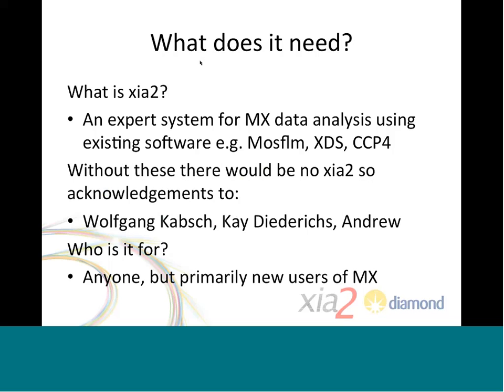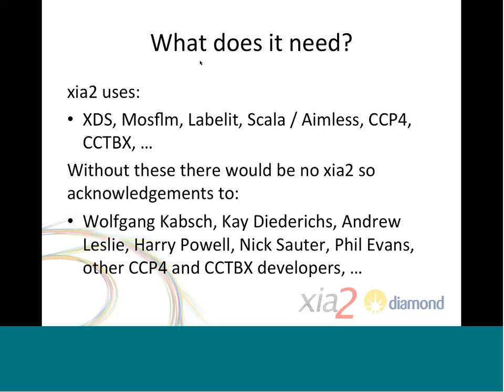Okay, so what does it need? Well, as an SB Grid user, this is all sorted out for you by magic, but XIA2 does actually use a whole bunch of software, which, if you added it all up, is probably a couple of decades or several decades worth of effort from these people listed here. So I have to kind of acknowledge the fact that without the effort from all of these people here, there would be no XIA2, because it does run a lot of other people's software on your behalf. So acknowledgements to all of these people here.